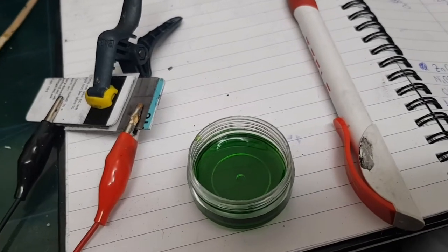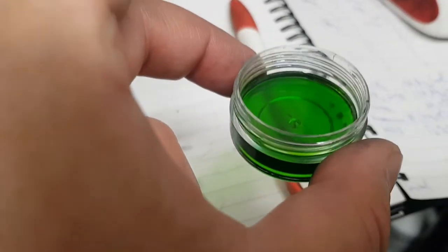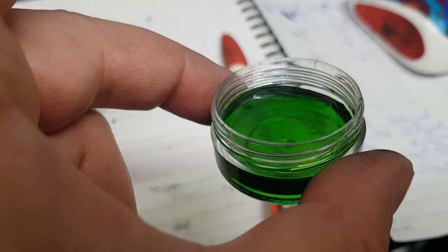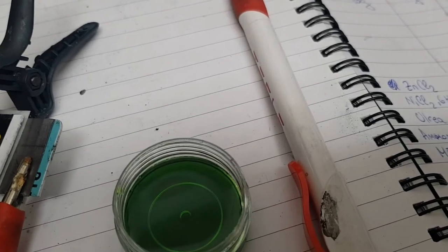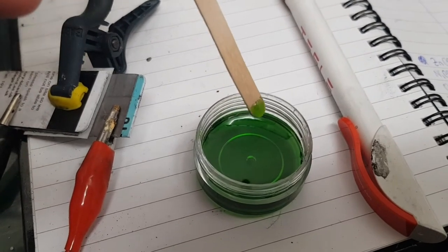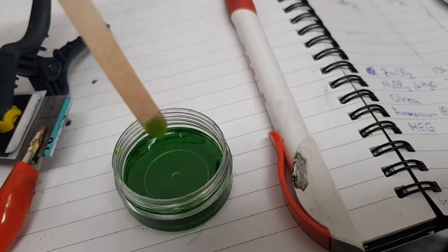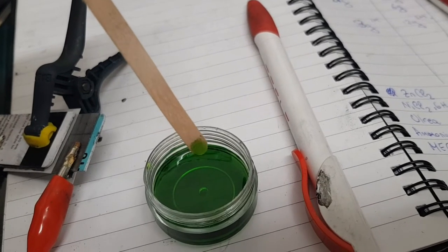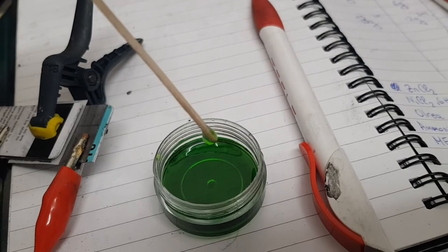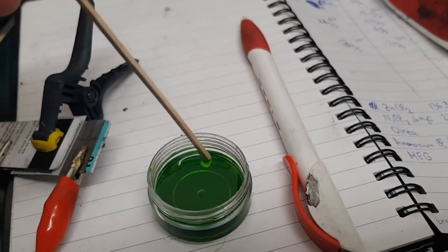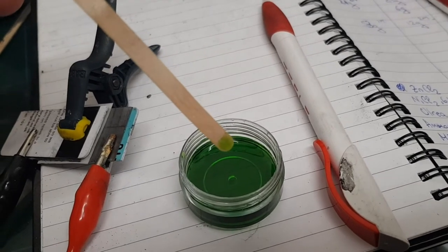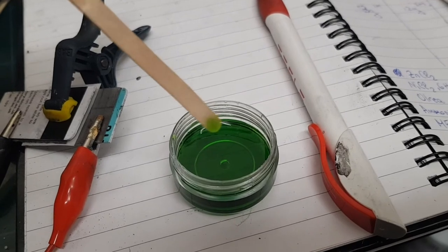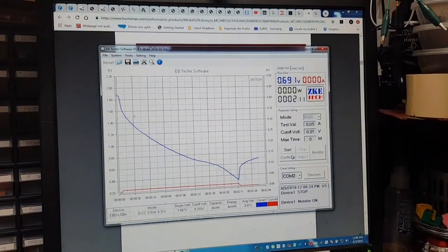If we look at the nickel-based deep eutectic solvent, it is crystal clear and has a high viscosity. I would say that it has a viscosity similar to maple syrup. Really, really nice. I've just noticed that the other cell finished after two minutes.